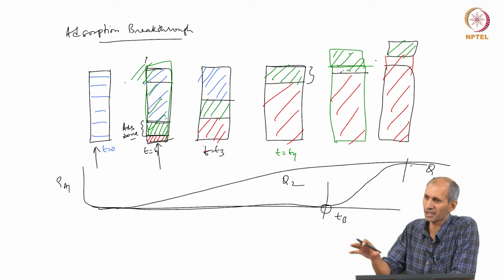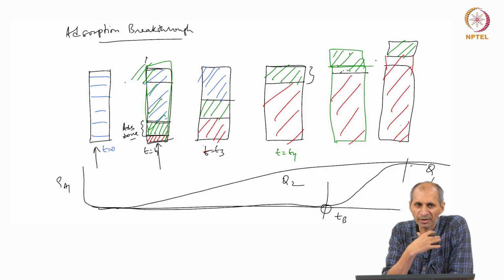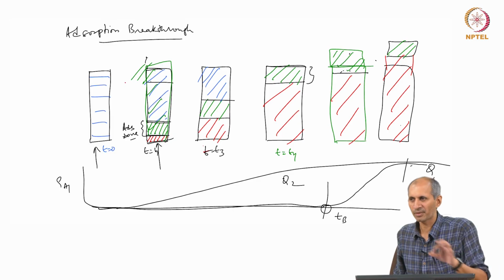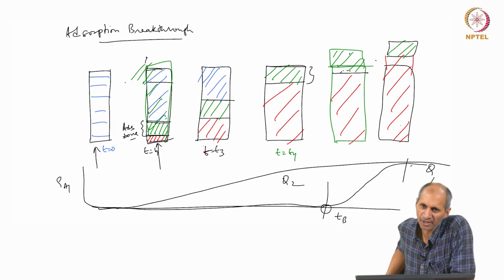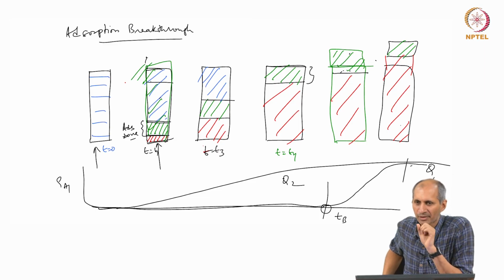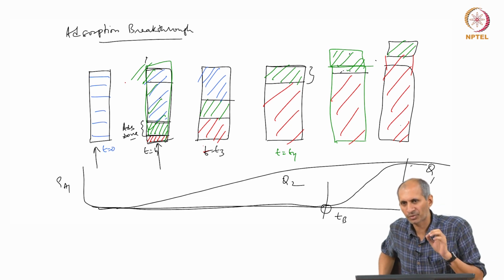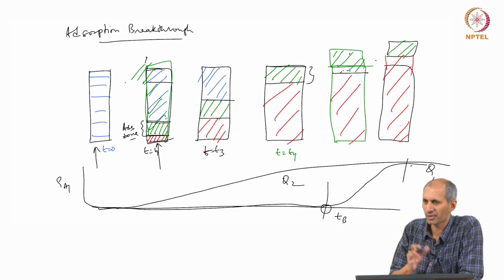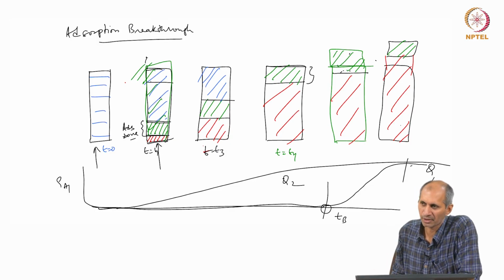So, you are just shooting, it has no time to adsorb, it is just going through, which is the reason why these columns have a flow rate written on it. So, you cannot operate it above that flow rate. It is basically the velocity, flow rate depending on the velocity, on the porosity and all that, they calculate velocity and they back calculate flow rate because that is what you are measuring. So, for this column there is a flow rate specification that is given, and this is true even when you are doing wastewater treatment or waste adsorption for purification.